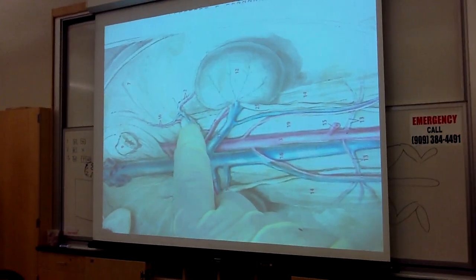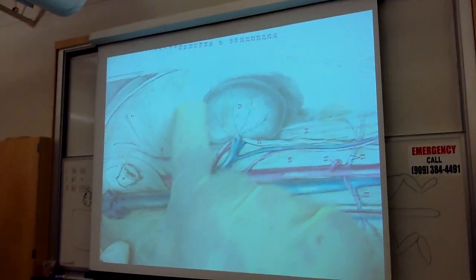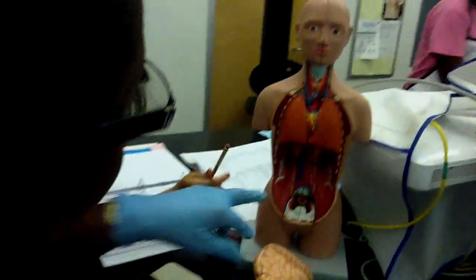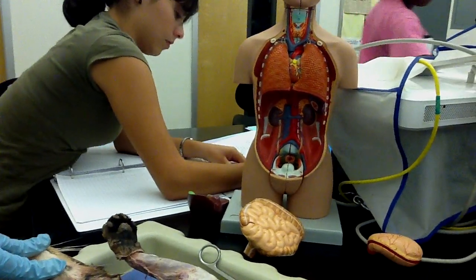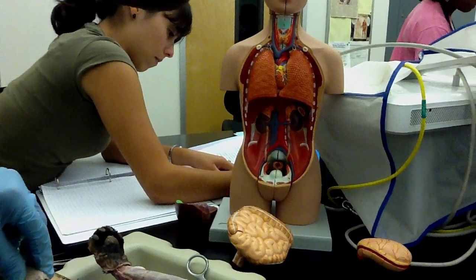That's the adrenal gland for the cat. On a human, that sits over here above the kidney. Look at your model and look for some orangish, lumpy stuff right above the kidney. Looks like a little hat, doesn't it? Those are the adrenal glands in the human being. That's where your adrenal glands are.